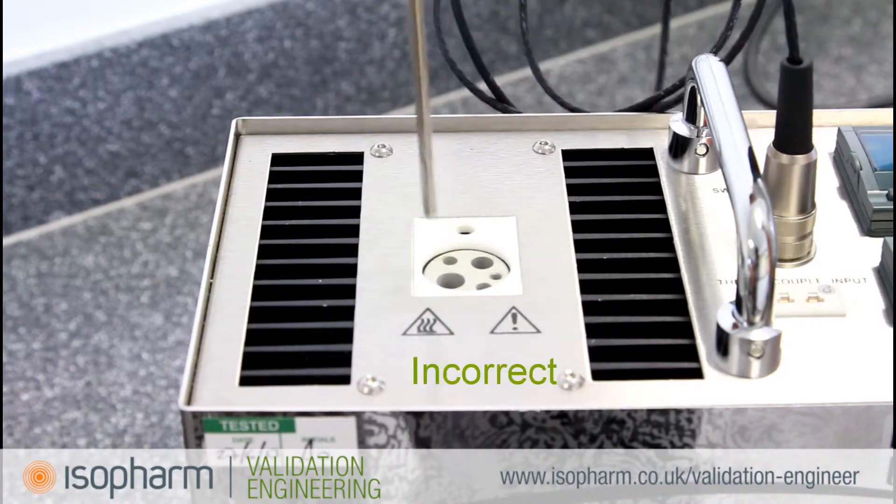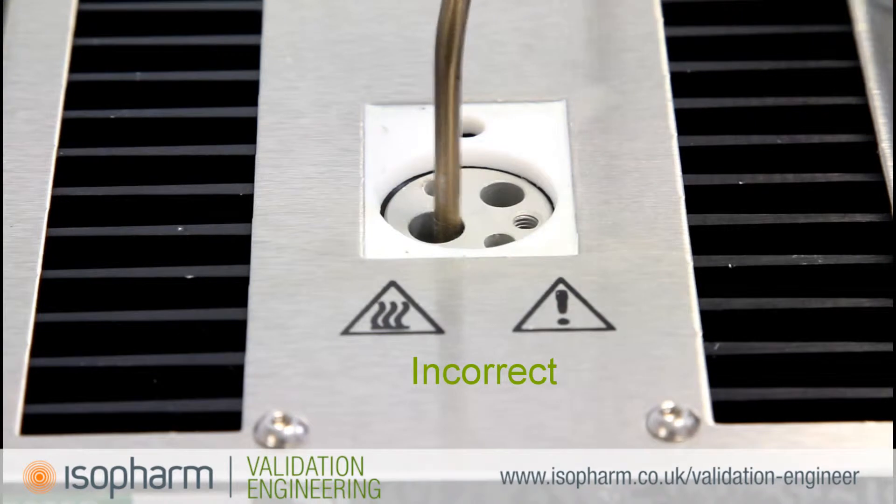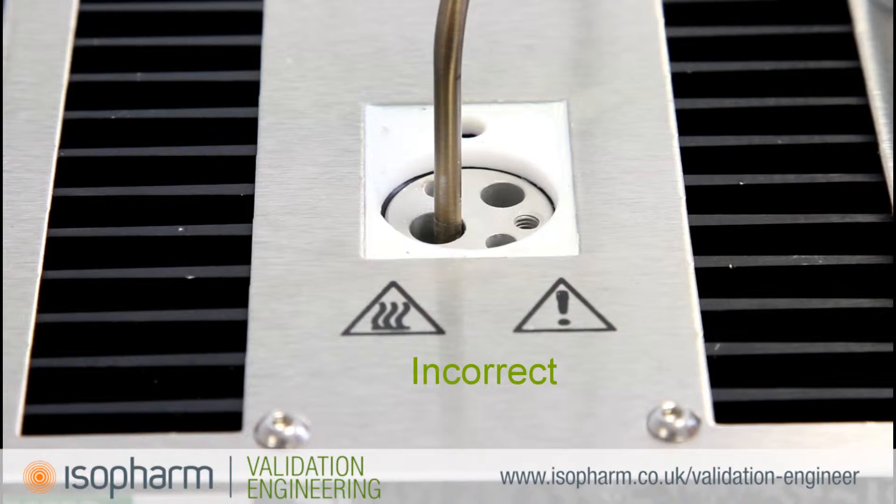It is important to insert the reference probe into the correct hole in the well to minimise airflow around the probe. The probe should reach all the way to the bottom of the well to ensure accurate calibration.